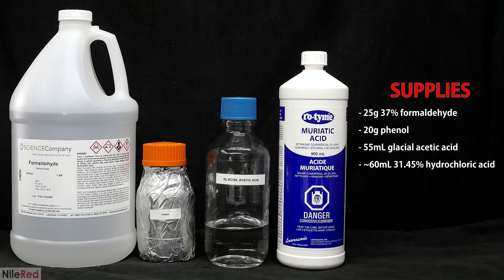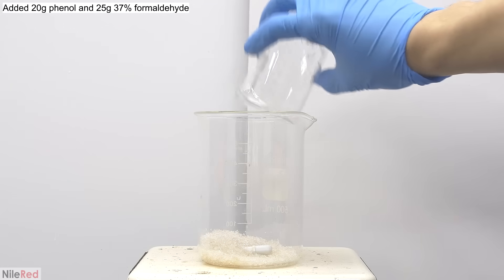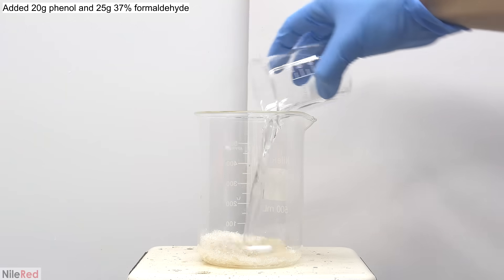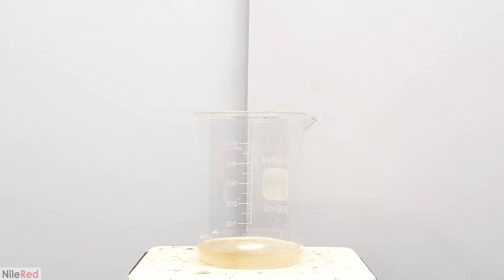To start things off, I'm going to do the typical classroom Bakelite demonstration. To do this, we're going to need a few main ingredients: phenol, formaldehyde, glacial acetic acid, and concentrated hydrochloric acid. I add some phenol to a beaker, and then I pour in formaldehyde solution. I turn on the stirring, and I wait for all of the phenol to dissolve. It has a yellow color because my phenol is a little bit dirty.